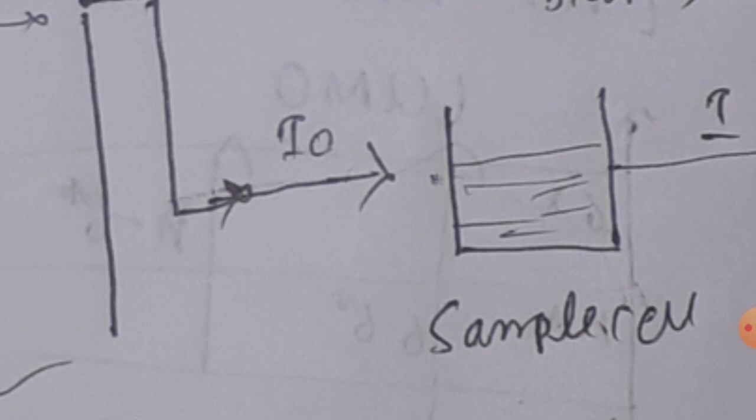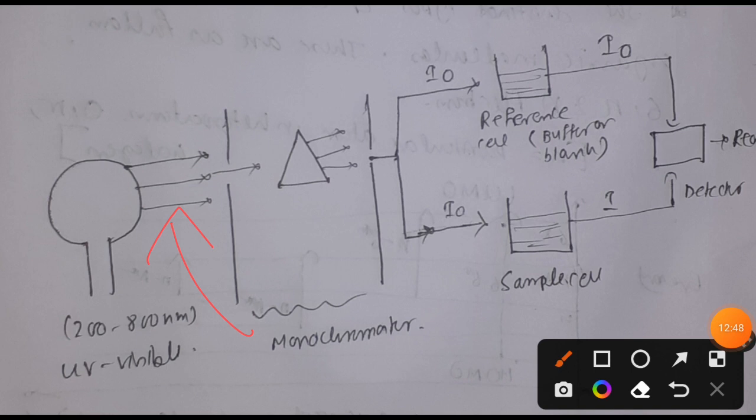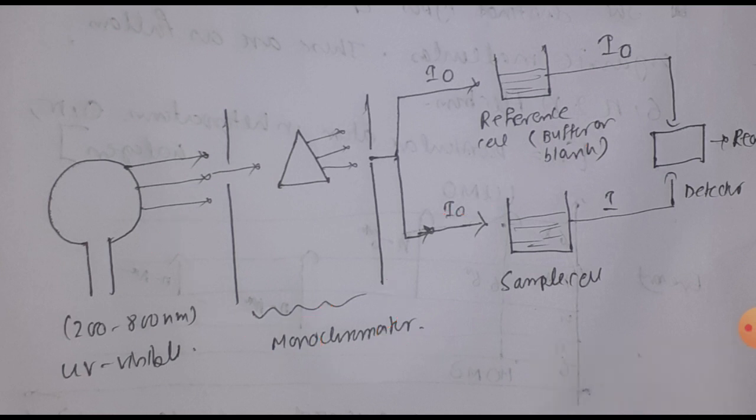If you are talking about infrared spectroscopy, where we are using electromagnetic radiation of infrared rays, then the picture will be completely different. In that case, the samples present in the sample solution, after absorbing the electromagnetic radiation, will observe some change in their vibrational energy. That is known as molecular vibration, which we do not want to discuss here because our topic is UV visible spectroscopy.